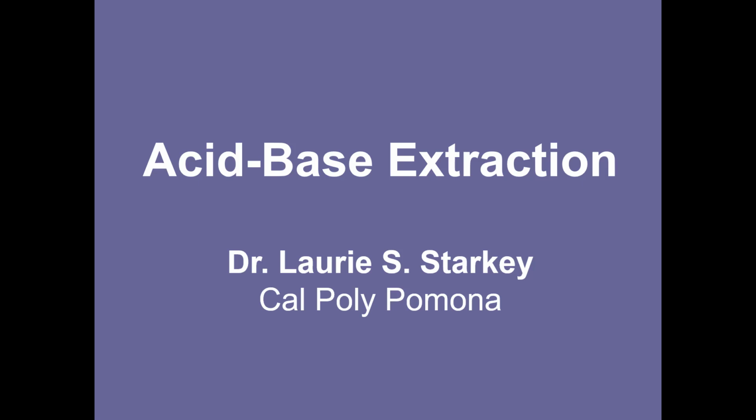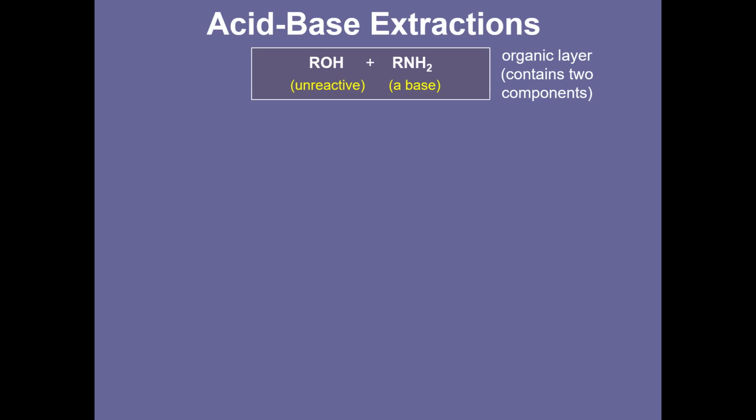Welcome to this tutorial on acid-base extraction. An extraction technique can be used to separate a mixture if one or more of the components have acidic or basic functional groups. Let's look at a mixture containing an unreactive alcohol and a basic amine dissolved in an organic solvent.